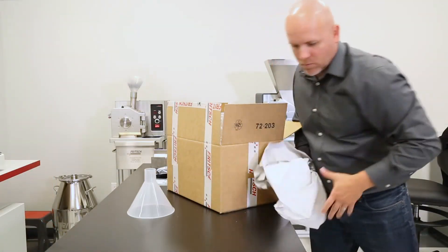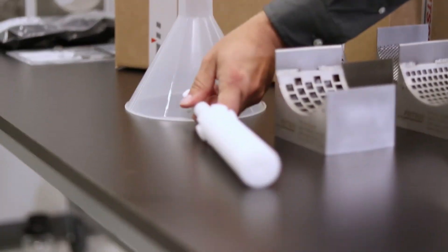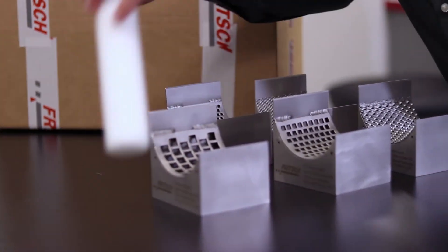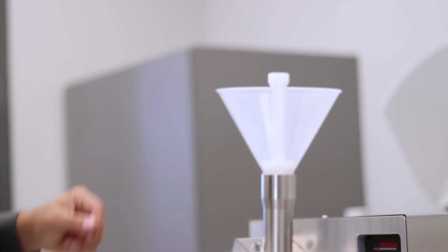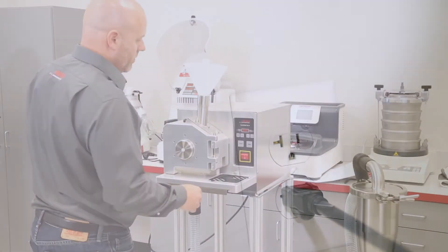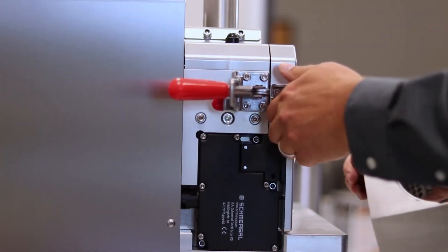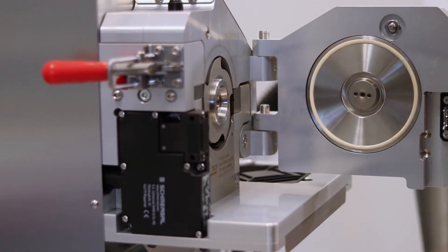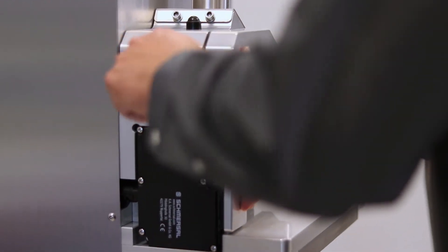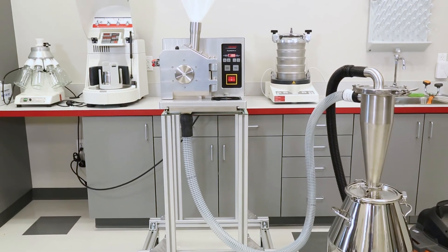Remove the funnel and plunger and all of the sieve cassettes from the shipping box. In the United States and Canada, plug the P19 mill into a standard 110-120 volt, 15 amp circuit. Please note that the front door of the mill will not open unless the unit is powered on. Now you are ready to put your P19 mill to work. Please see our other instructional videos regarding operation and cleaning procedures.